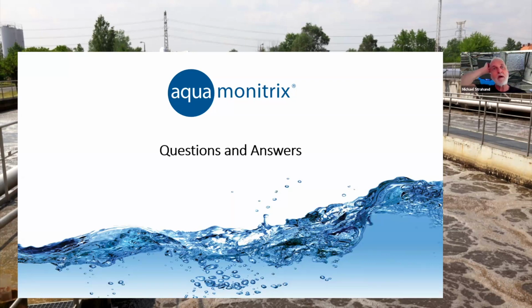I think that I can handle that one, Peter. The filter that we're talking about is a pre-treatment filter. Some of our clients have existing analyzers with cartridge membrane-based filter systems to present a sample. So we weren't so much talking about the wastewater treatment process being MBR or MABR.